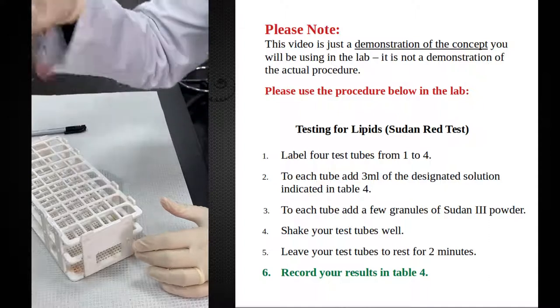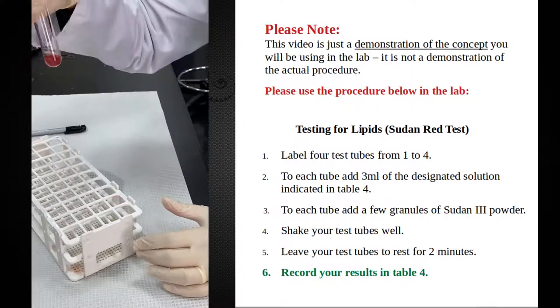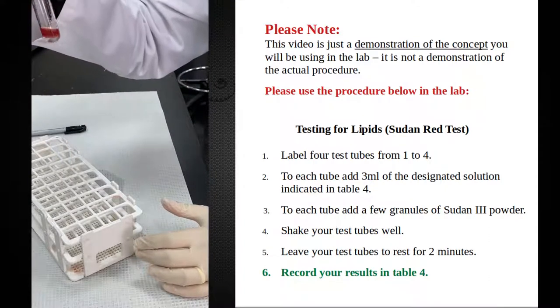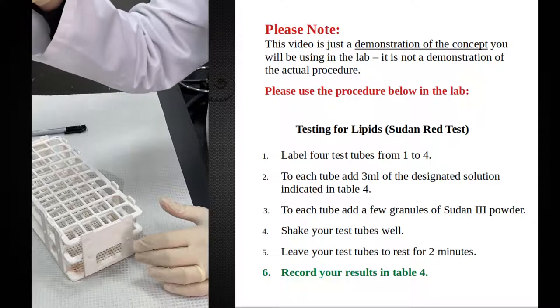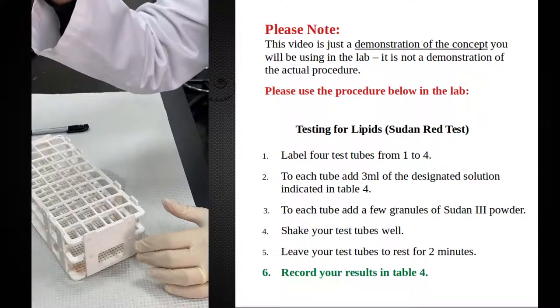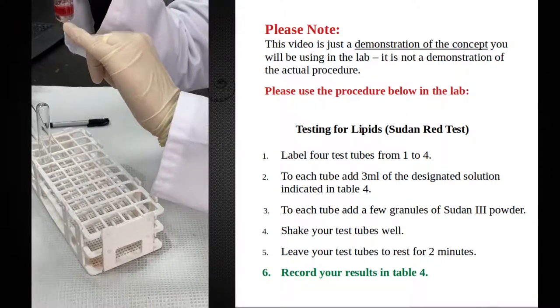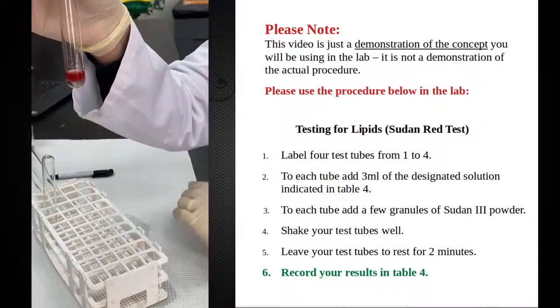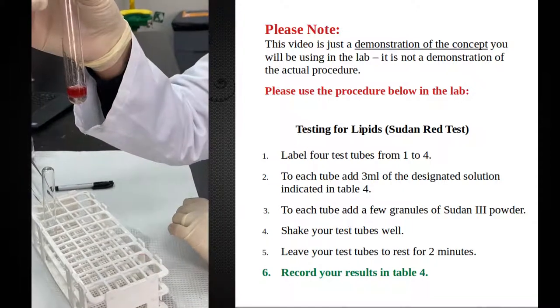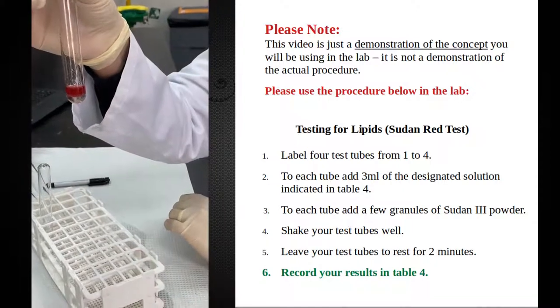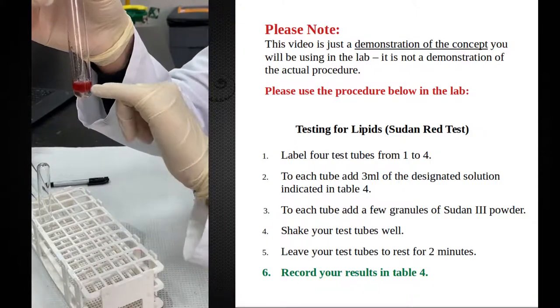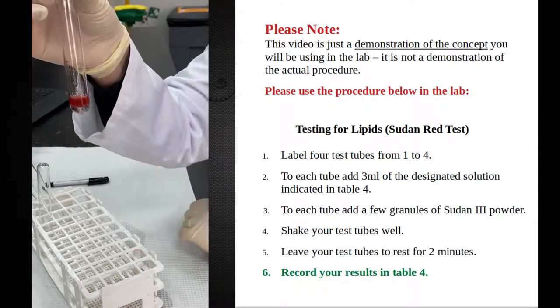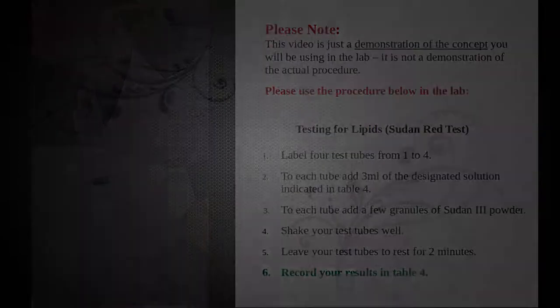So I will mix, and I will give it a few seconds. And as you can see, this is the water — the aqueous solution. The Sudan did not dissolve in it. And this is the fat solution — it becomes homogeneous.